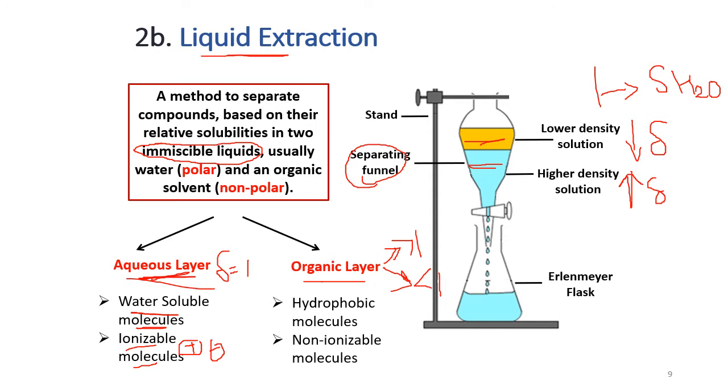However, the organic layer would constitute any hydrophobic molecule, any molecule which doesn't love the water but will rather prefer the organic solvent, or any non-ionizable molecule, any molecule that cannot form ions, that is covalently bonded, will also be found in the organic layer.